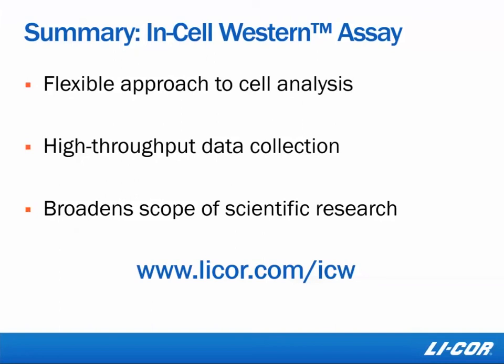That's a great question. Primary antibodies on the market may not work well for these types of assays. Now, when you're choosing a primary antibody, make sure that the primary antibody is validated for immunohistochemistry work. Now, once you have that validated primary, you want to make sure that it's specific using a Western blot. Now, if you have a primary antibody that has non-specific bands, you want to optimize that primary antibody by optimizing things like your blocking conditions. Now, once you have that primary antibody that's been validated for immunohistochemistry and is specific towards your target, then you can go ahead and move into the plate-based assay.